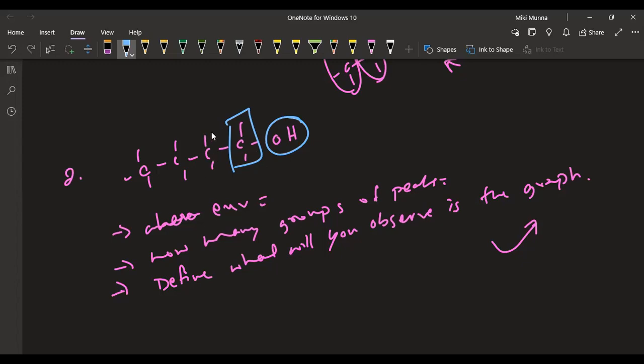With respect to this one, what do we have towards the right? We have CH2, then we have OH. However, towards the left, we have CH2 and CH2. So this CH2 is unique, isn't it? Towards its left, it had two CH2 and one CH3. But for this one, towards its left we have one CH2 and one CH3. Towards its right, we had one OH, but here towards its right, we have one CH2 and one OH. That means this is another chemical environment.